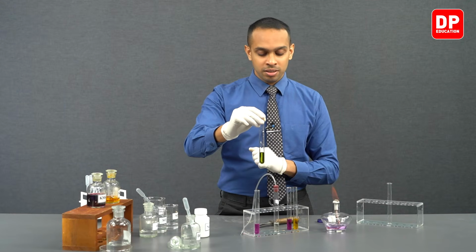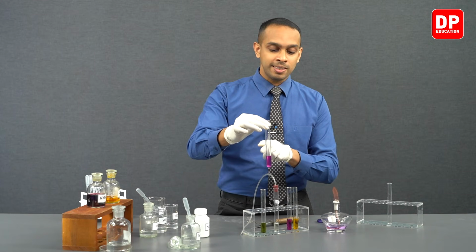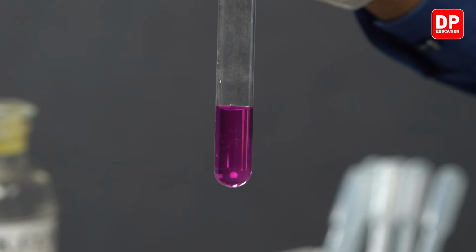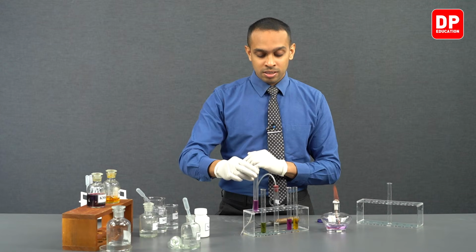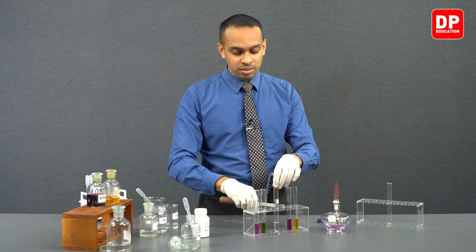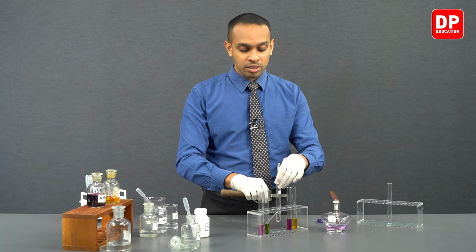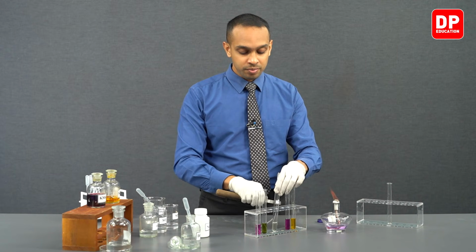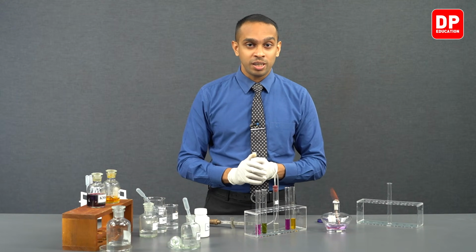So now, students, we can move on to acidified potassium permanganate. Acidified potassium permanganate is purple in color. Let's send sulfur dioxide gas through it. We have already added the two reagents together. We can heat up the mixture again, and you will observe that the solution will also change color.